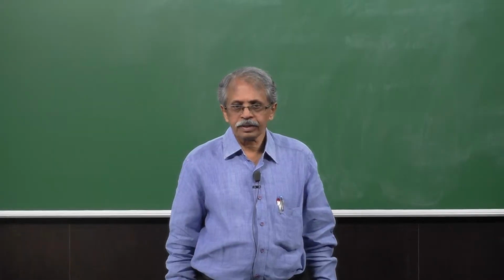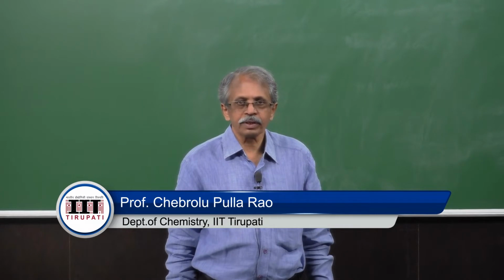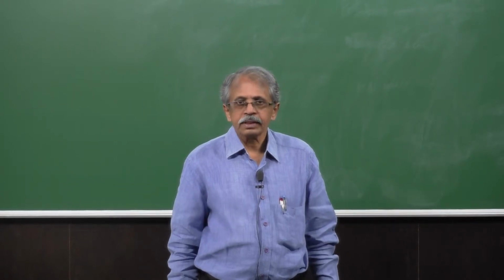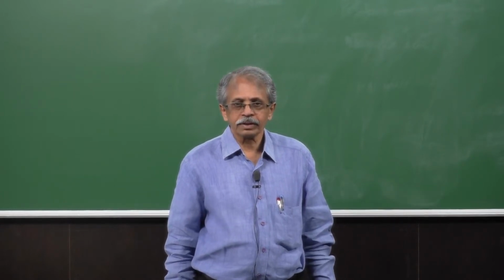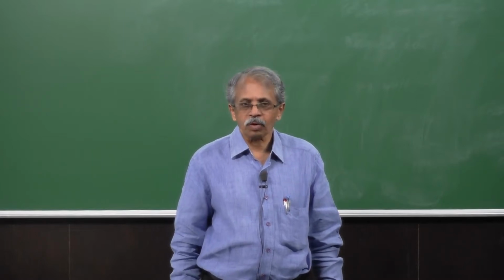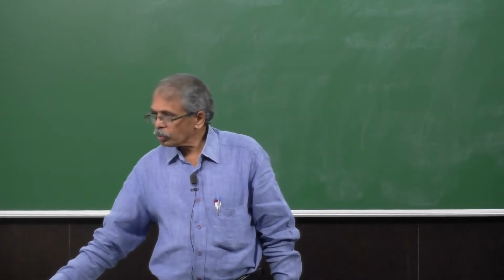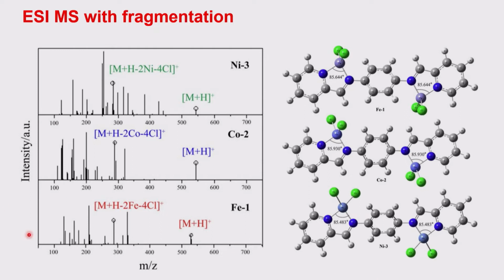Good morning, welcome you all to this continued lecture on this particular topic on mass spectrometry. In the previous class, I have been talking about the isotopic pattern, how it can be helping the process, even the way that the reaction goes, etc. Let us look at the spectra, for example, how we understand the spectra for coordination complexes. So here, please have a look at this particular slide.